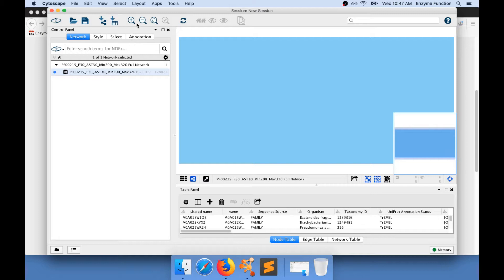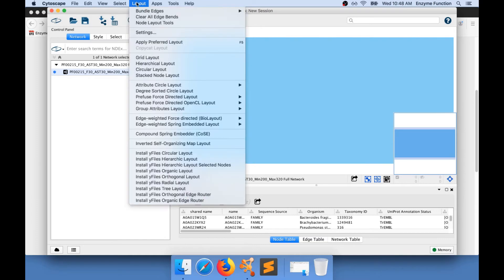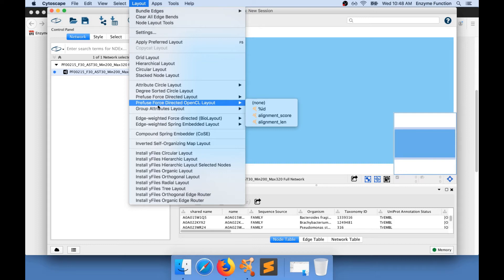The first thing to do when you have a network that is loaded into Cytoscape is to apply a layout. To do so, go to Layout and apply a layout. I use Prefuse Force Directed Layout using None as a parameter.